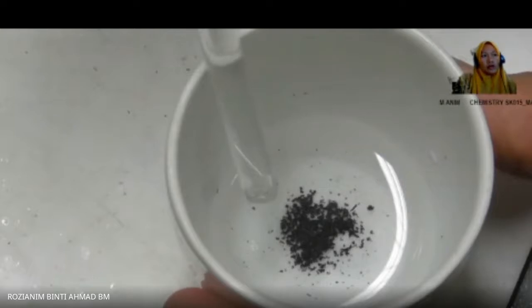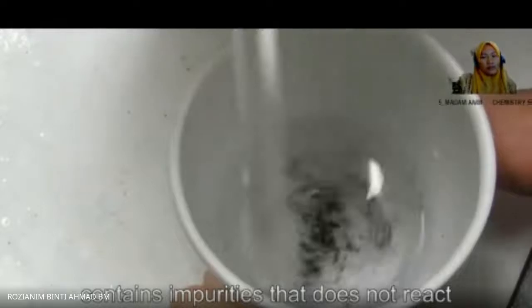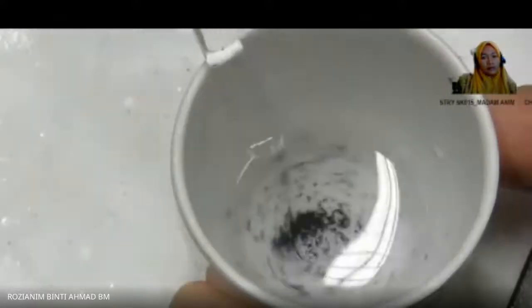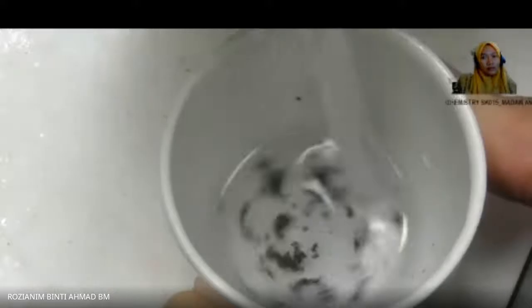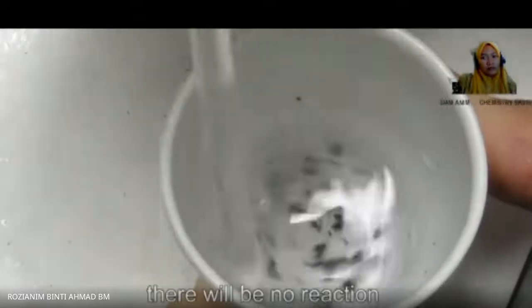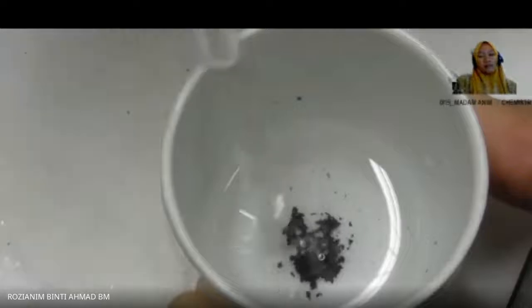This is a common problem that occurs. Sometimes the zinc powder contains impurities that do not react with hydrochloric acid. Check whether the solid left in the mixture is zinc or impurities. Add more hydrochloric acid. If the solid is not zinc, there will be no reaction and no gas bubbles will be formed.